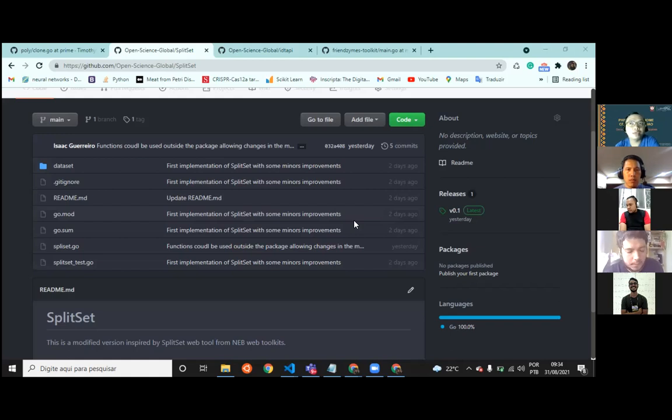And in some cases, we might need longer controls, let's say for conventional PCR for gene amplification instead of shorter controls for real-time PCR. But the challenge we see right now is that G-blocks at sizes more than 1 kb are not recommended for PCR applications. So I'm not sure how the software could perhaps address it. What else? I think so far those are my insights specifically for the software, but it's really interesting that we have these functionalities right now.